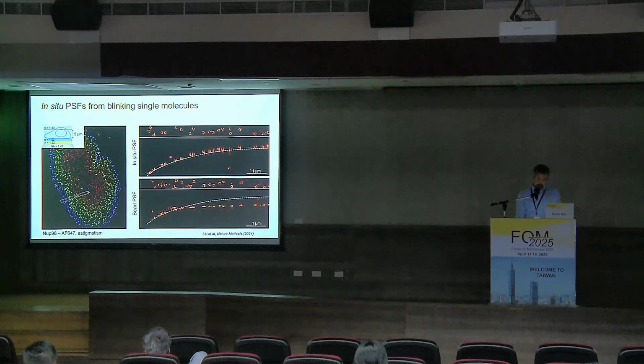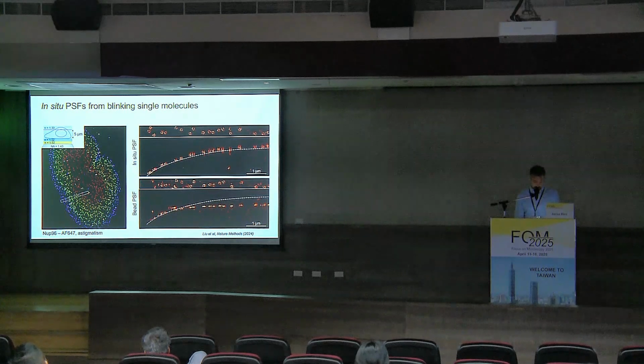So in contrast, when we use the in situ PSF, we avoid this kind of deformation, this squeezing. We do get much better data, but of course the spherical aberrations reduce the contrast in the point-spread function, so we do lose compared to having a well-index-matched medium. Still, I think this is quite useful whenever you expect aberrations.